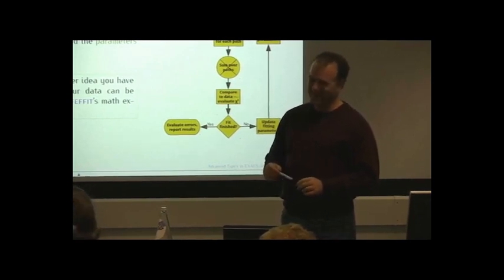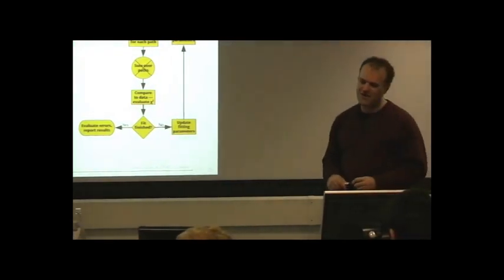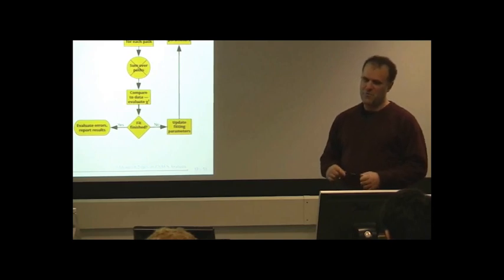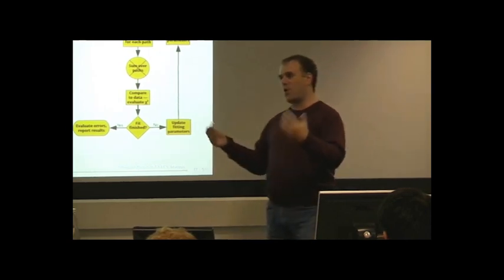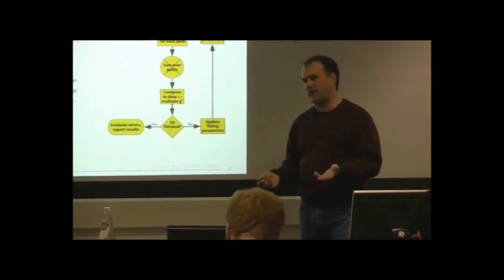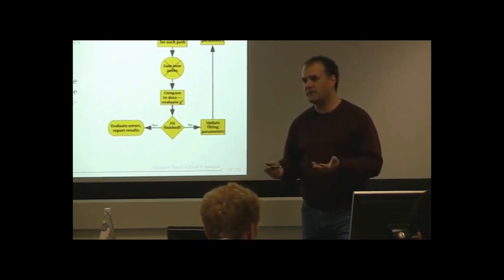So I choose to just get out of the argument and drop the +1, drop the +2, because the truth of the matter is that if you're worried about the +1 or the +2, you are probably trying to fit too many parameters. Because the signal is not ideally packed, we probably don't really have quite that many parameters. In fact, the people who have done Bayesian analyses of XAFS suggest that the real number is something like 2/3 of delta k delta r plus 1.